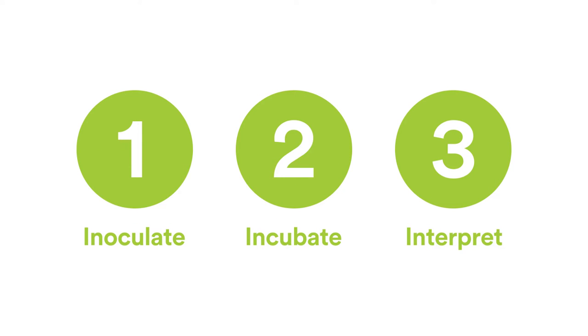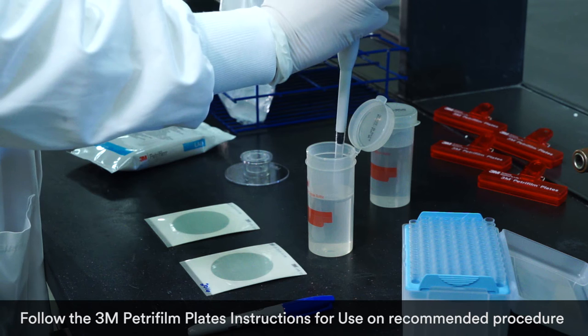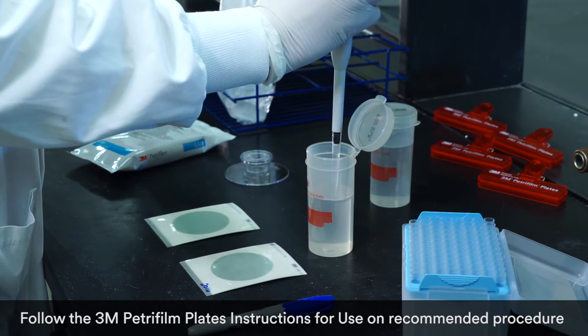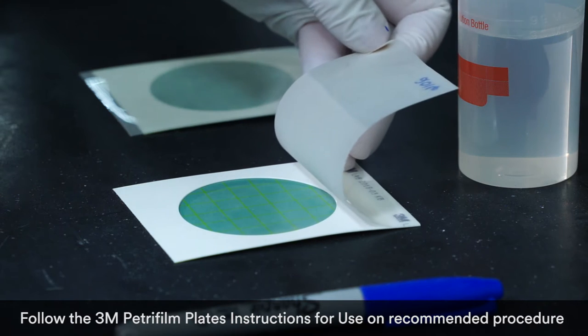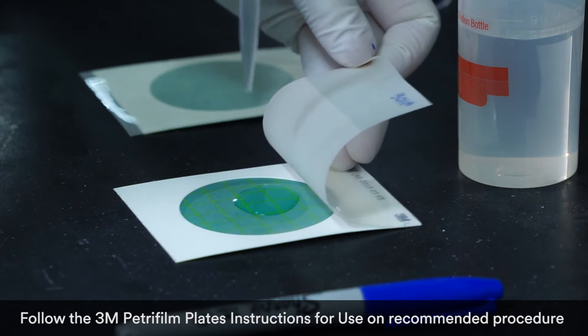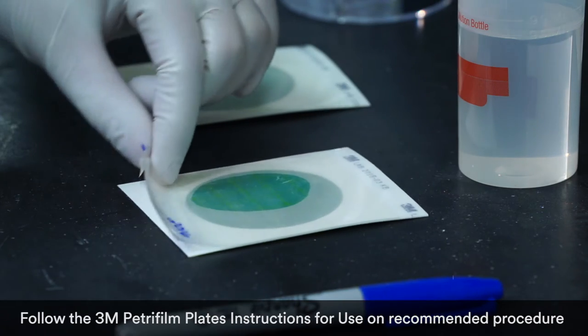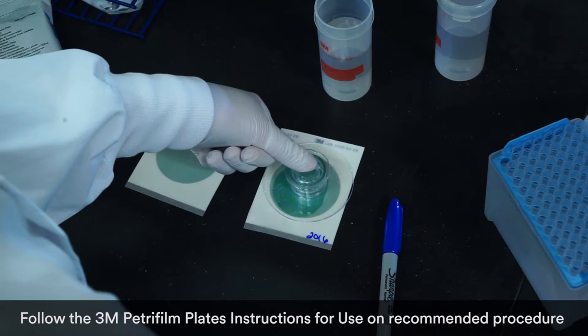With 3M Petrifilm plates there are just three simple steps to getting consistent, reliable test results. Step one: inoculate. Each slim pack of Petrifilm plates contains uniform testing media. Simply open the pack, take out one plate, lift the top film, and dispense one milliliter of the prepared diluent onto the center of the bottom film — no cumbersome, time-consuming agar prep required.